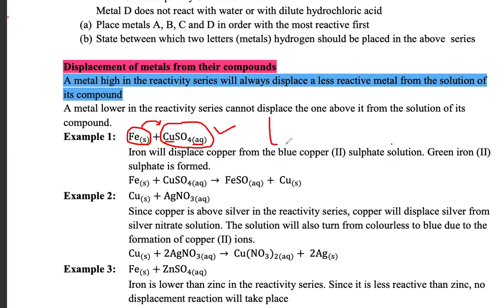Now, in this solution of ours, where I've got copper 2 sulfate in here, we dip in an iron nail. You know, the nail is made up of iron, right? Yes, it's made out of iron. Yeah, we dip an iron in that solution.